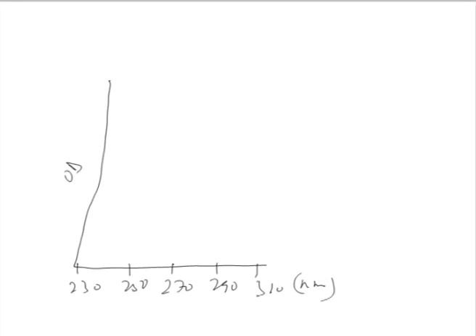And the third part we were talking about is the orientation effects, that is, how a molecule is present in a situation. If we take optical density here, and the example we are taking is of DNA, I think all of you know that DNA is present in different forms.